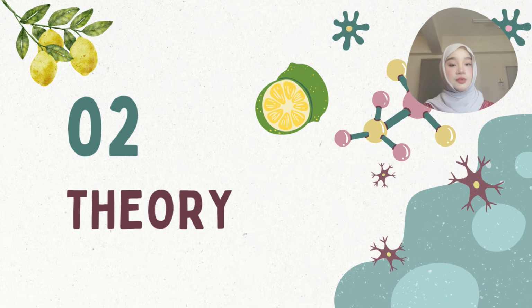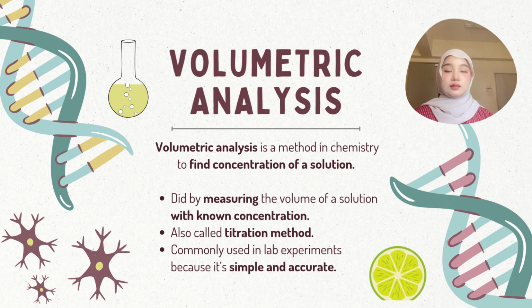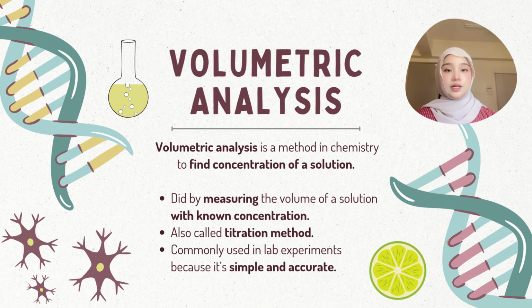And now, let's move on to section 2, theory. In this section, we are going to dive into the core chemical and scientific principles that make our experiment possible. For our theory part, I will explain volumetric analysis.